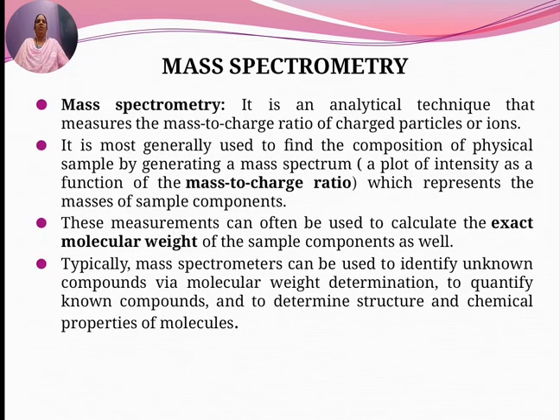Mass spectrometry. It is an analytical technique or tool that measures the mass to charge ratio of charged particles or ions.